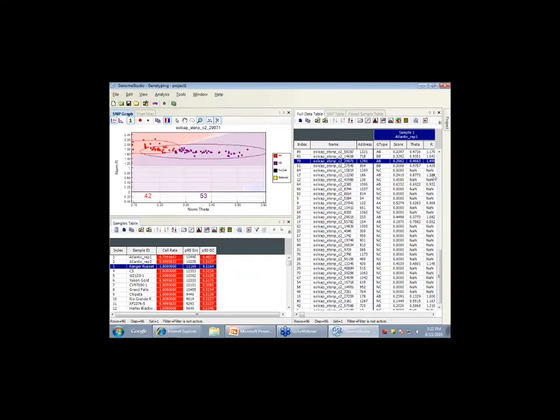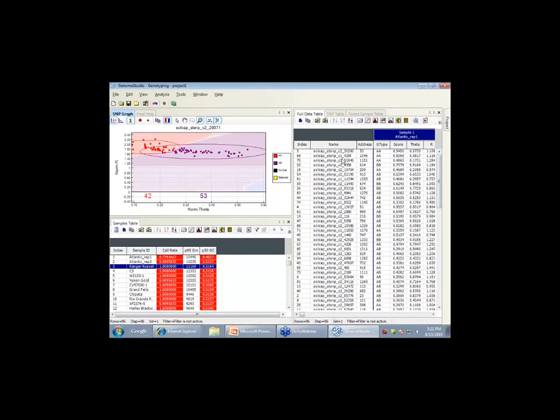So what I'm going to show you now is something SolCAP is going to do and provide for basically our chip arrays, what's called a cluster file. We're going to go through all our SNPs and define the clusters. Instead of everybody having different cluster files and not necessarily having the same calls, you can import that cluster file from SolCAP and say, okay, this is the way SolCAP would have called it, based on the data set they have.